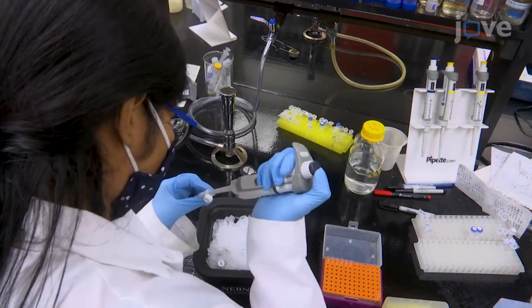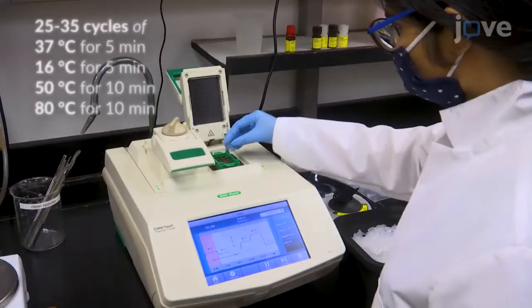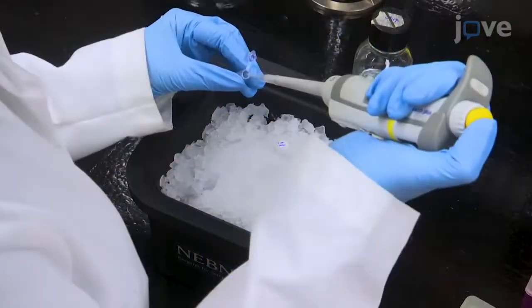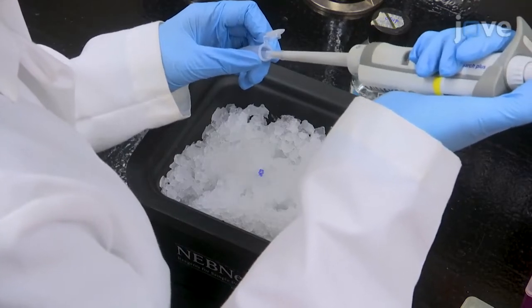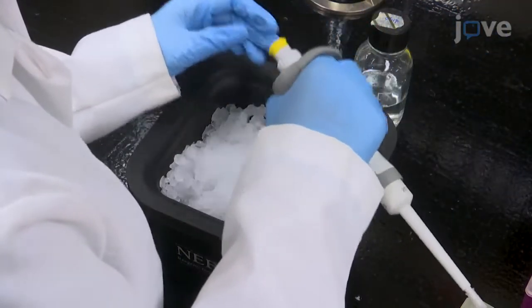Add double distilled water to bring the total volume to 10 microliters. Then run the cloning reaction. Transform the entire reaction mix into the DH5-alpha strain or equivalent Escherichia coli chemically competent cells by heat shock.